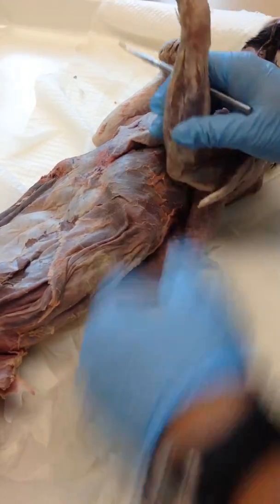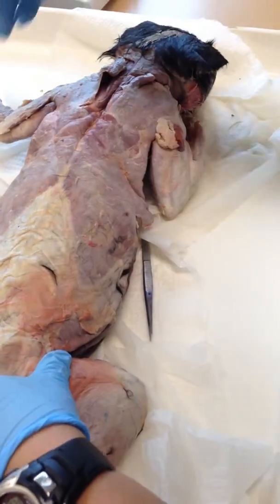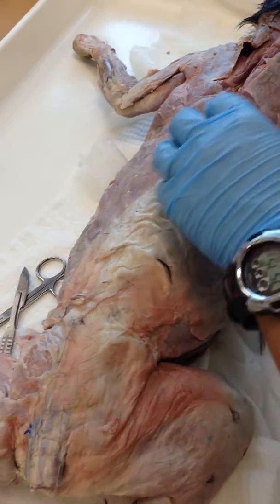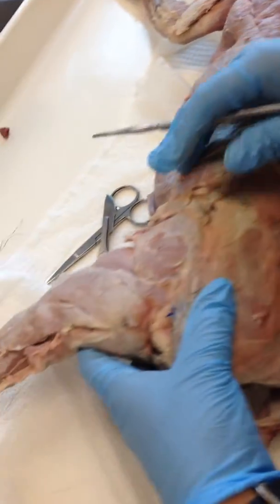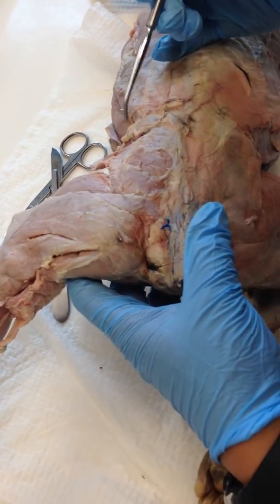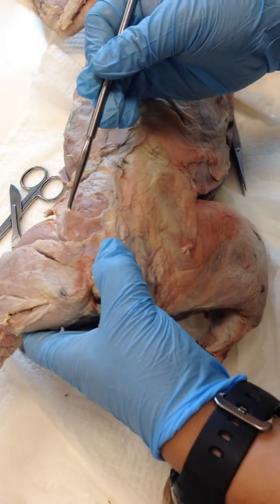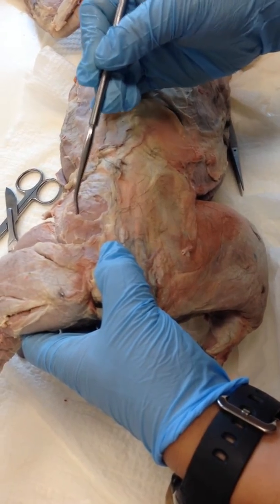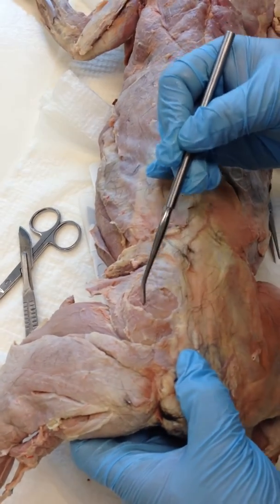Now we're going to go to the posterior side. So we're going to the posterior side of the cat, or Simba. We're looking at this one right here, this little flap right here, the gluteus maximus. Underneath that is the gluteus medius, small, large.